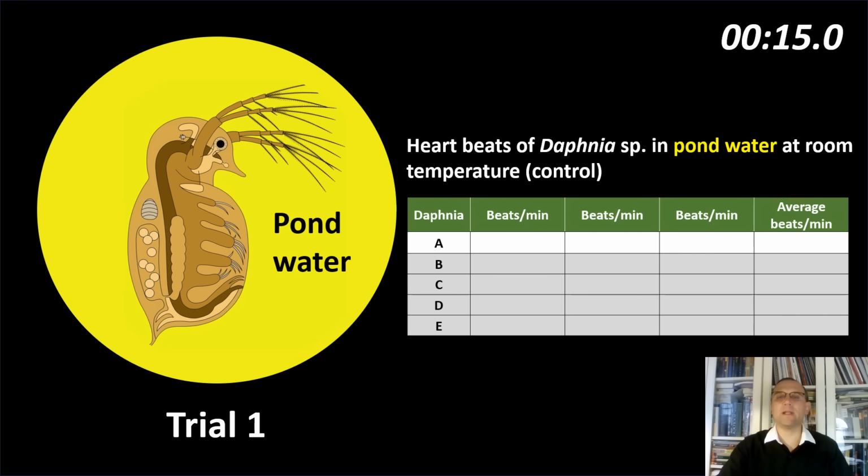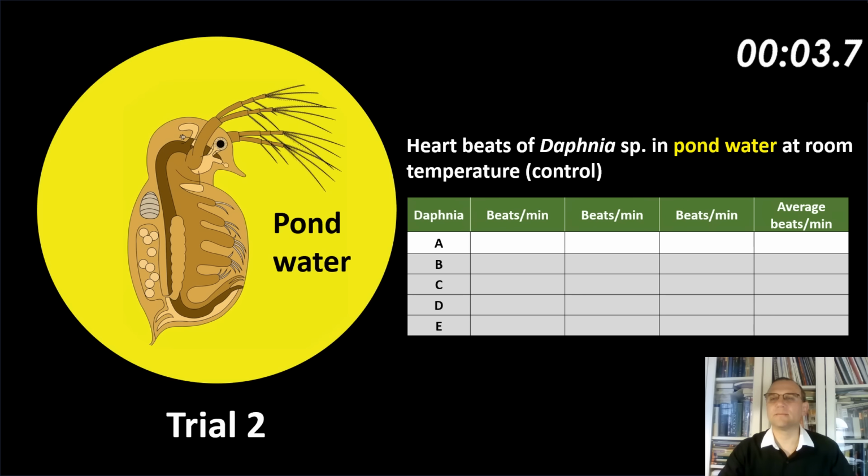Those students who work in the lab will have to get data for Daphnia B, C, D, and E from their classmates. Those who work at home will get these numbers from me at the end of this video. Let's get ready for our second trial. Ready? Start. Stop. Pause this video and record your second number.